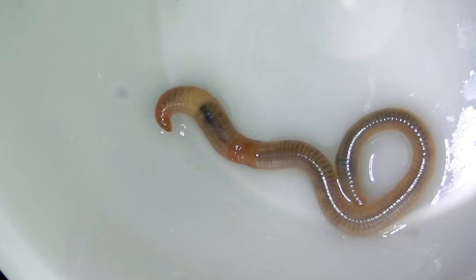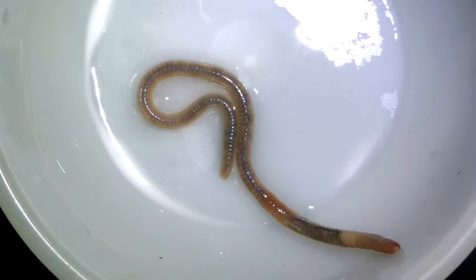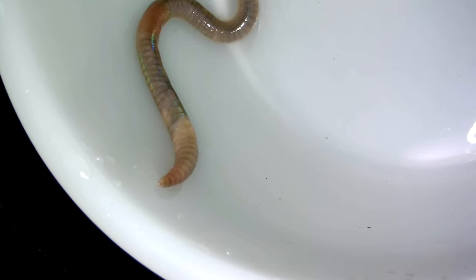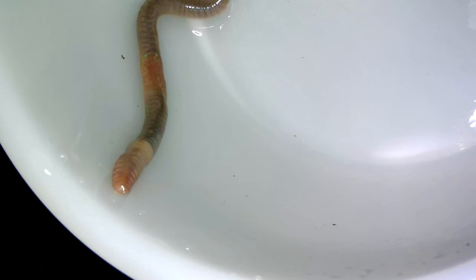Wow, look at this incredible animal. In folk's terms we usually call it a rainworm, but actually it's also called the earthworm. The amazing part of this earthworm is that it maintains our soil structure and improves the soil fertility.